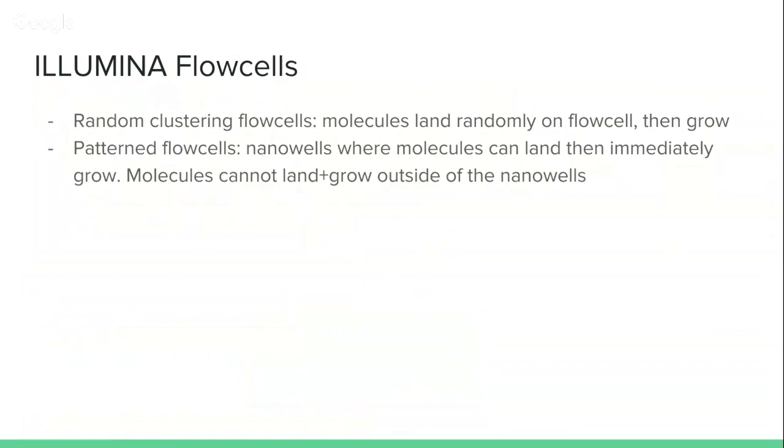And then this pattern flow cell technology has allowed the company Illumina to increase the density and the number of clusters that are produced in a sequencing run and produce more data.